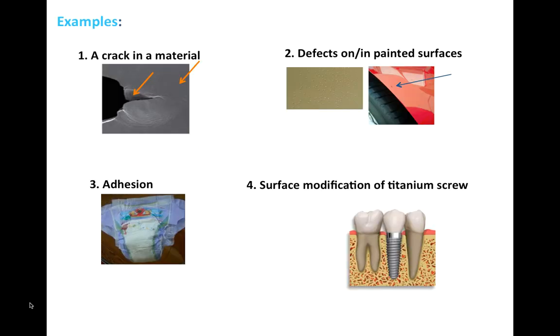As I say, you can use these techniques to check failure in materials, for instance cracks and defects, and also to look at adhesion in commodities like baby diapers, and also the surface modification in different biomaterial applications.